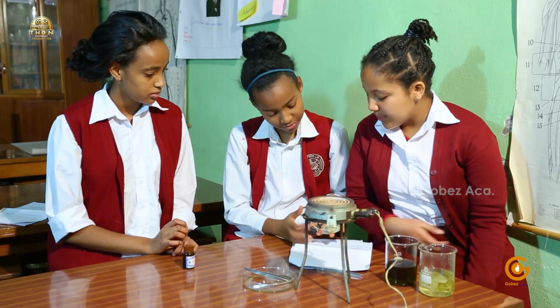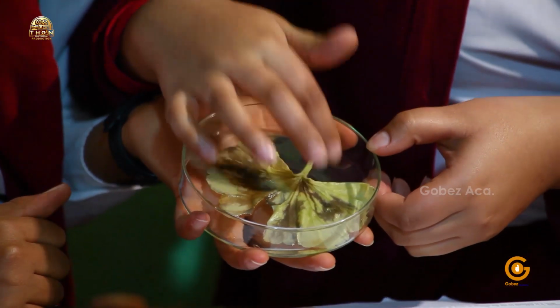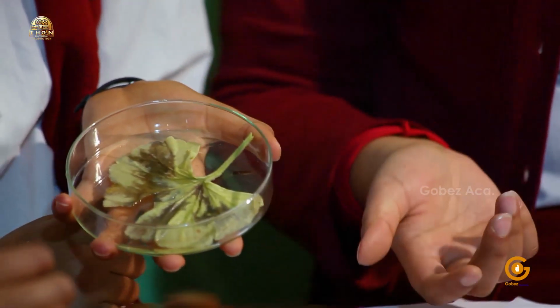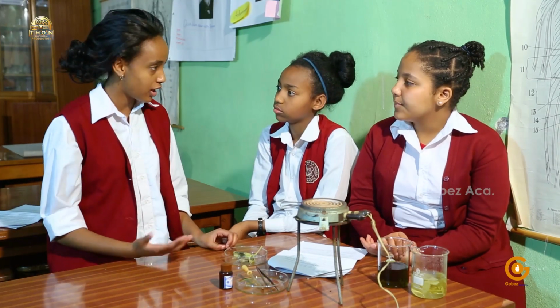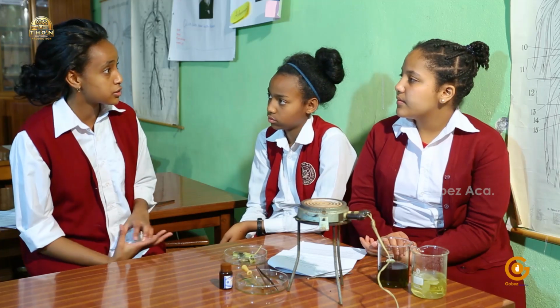Yes, the blue black color appeared over here, and this shows that the starch has been made by the process of photosynthesis. This experiment has showed us that photosynthesis is very important for the presence of starch, right?